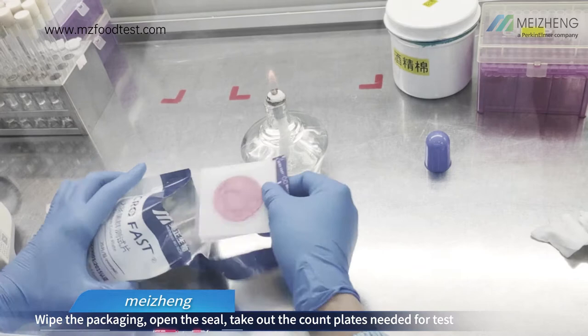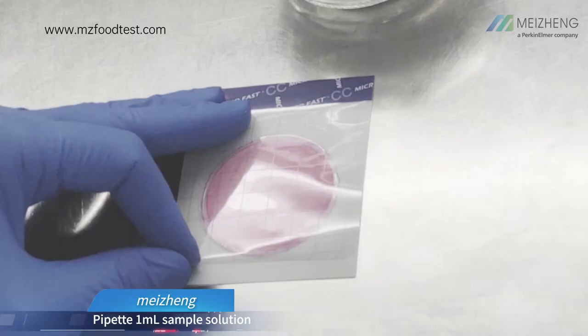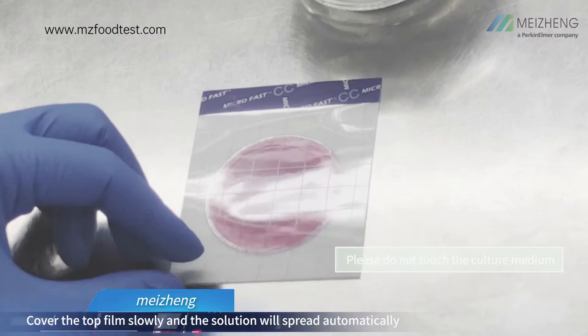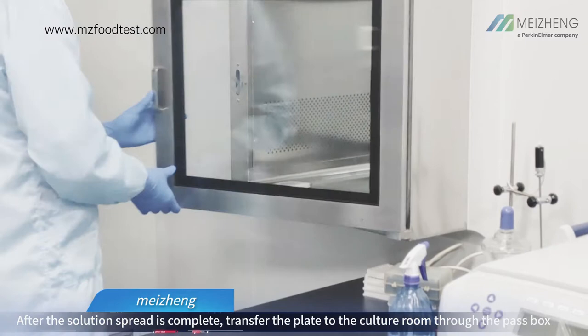Open the seal and take out the count plates needed for the test. Mark the count plates. Vibrate the diluent evenly. Pipet 1ml sample solution and drop onto the center of the plate vertically. Cover the top film slowly and the solution will spread automatically. Pressing the plate is not required.